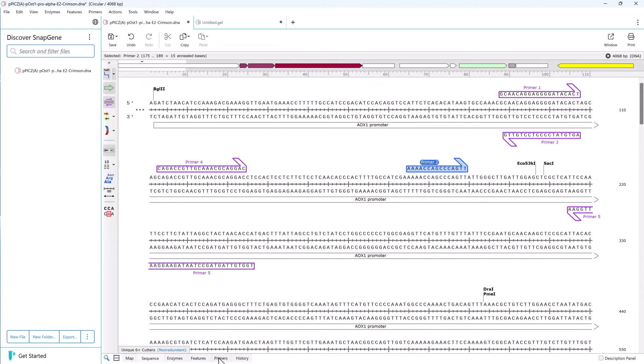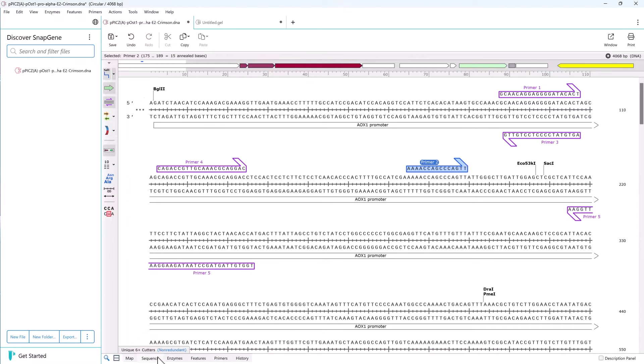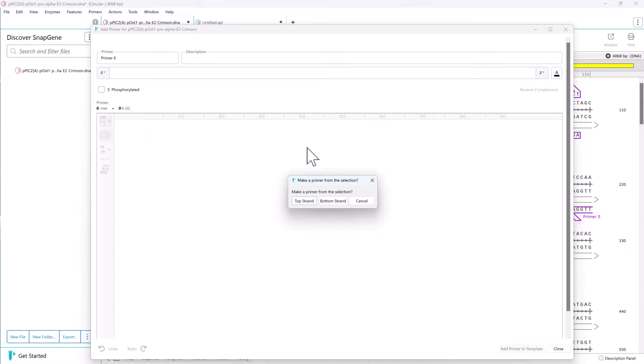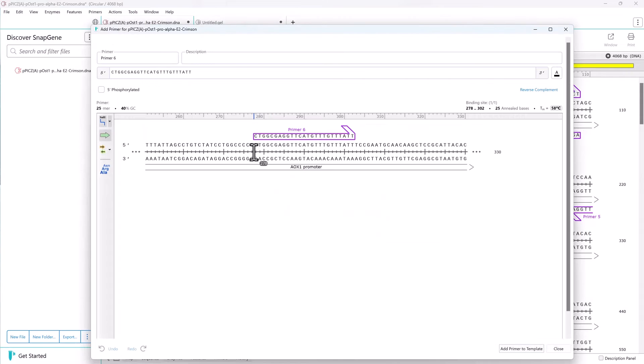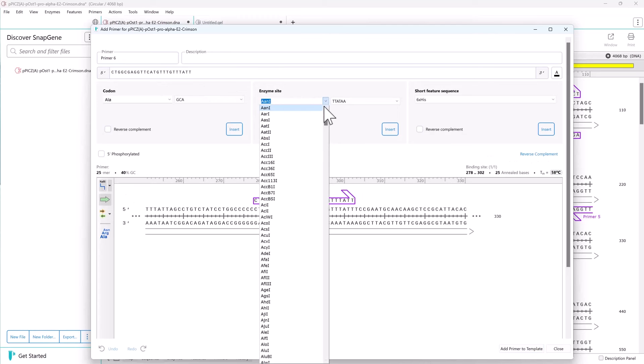It's also possible to manually create your own primers. Just highlight a region of the sequence, confirm the Tm, and add the primer. You can also add extensions to the primers such as restriction sites or nucleotides.